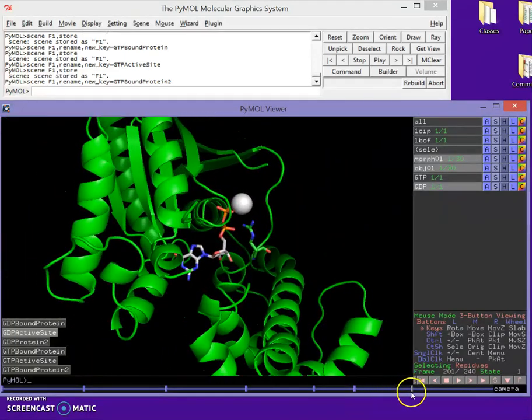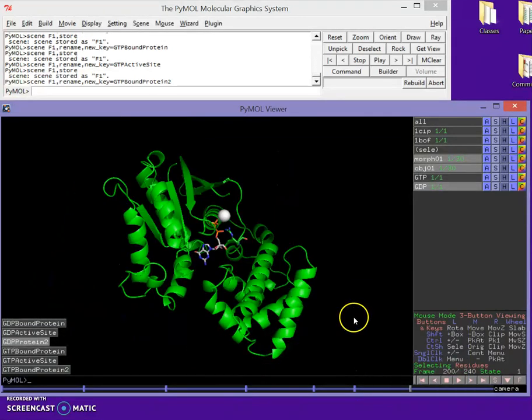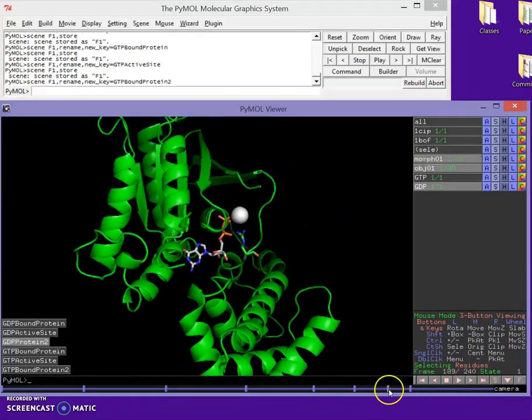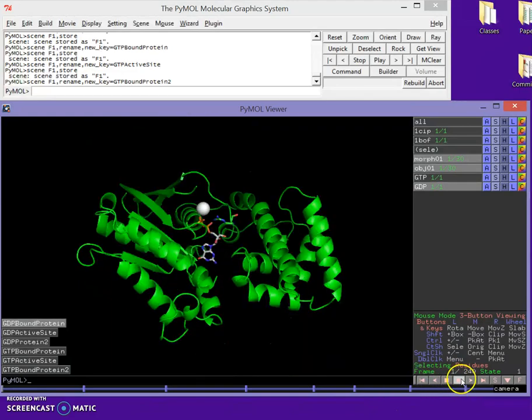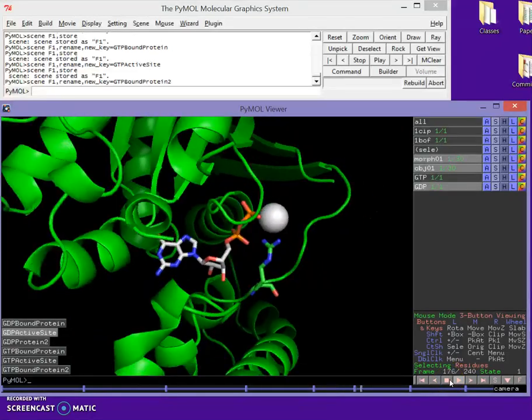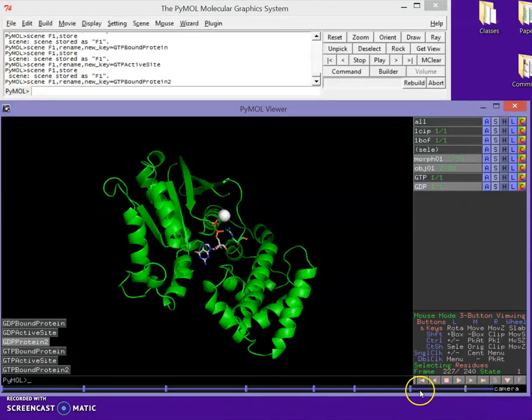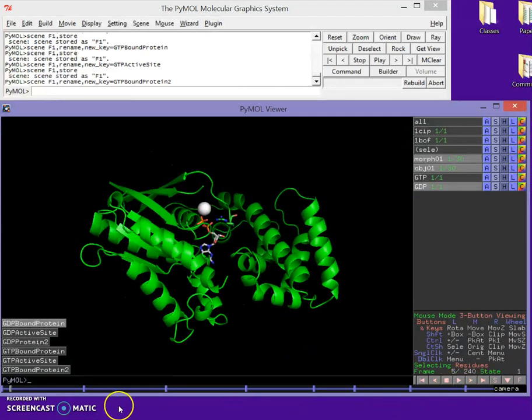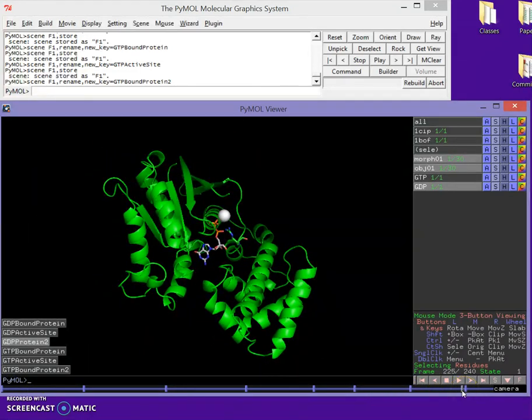Now I want to zoom back out, so I'll move the playhead further along and store scene 'GDP protein 2' — the movie will now zoom back out to the whole protein view. I'll copy that keyframe for a hold. Playing the whole thing: it spins around the Y-axis for four seconds, zooms into the active site and holds, then zooms back out. Now after showing the GDP-bound form I want to make it do the morph.